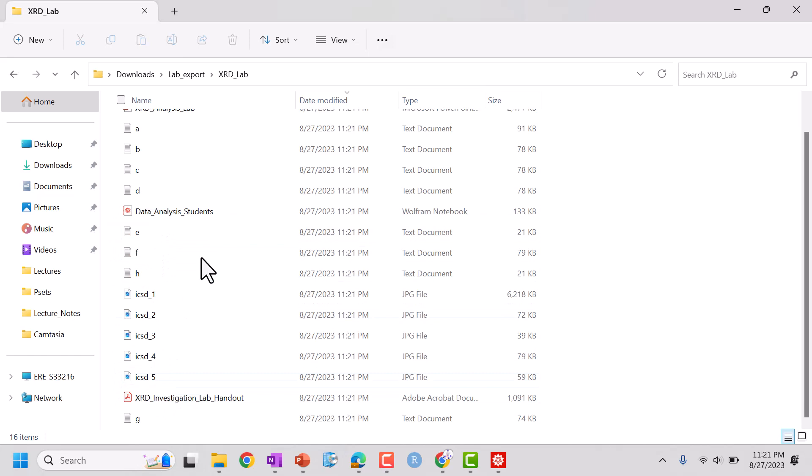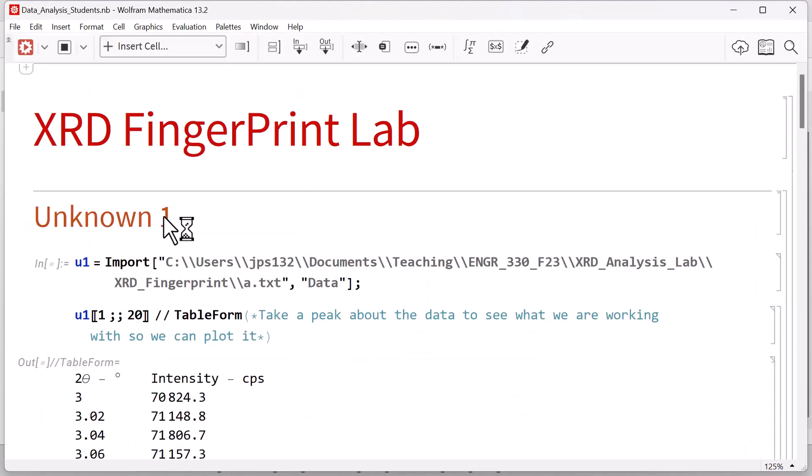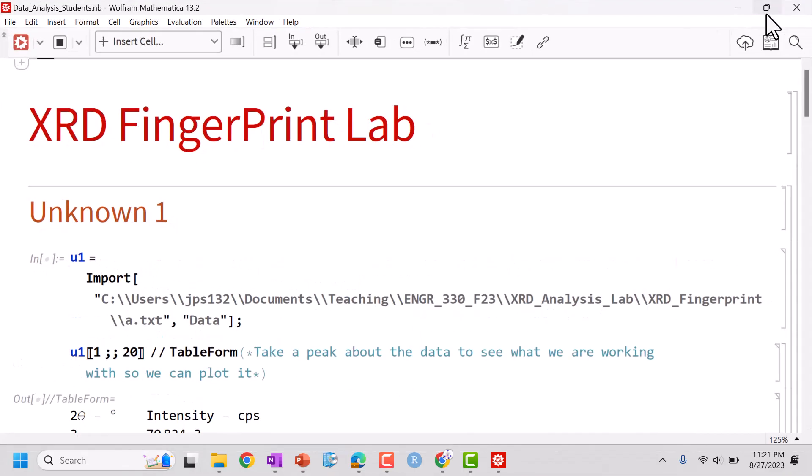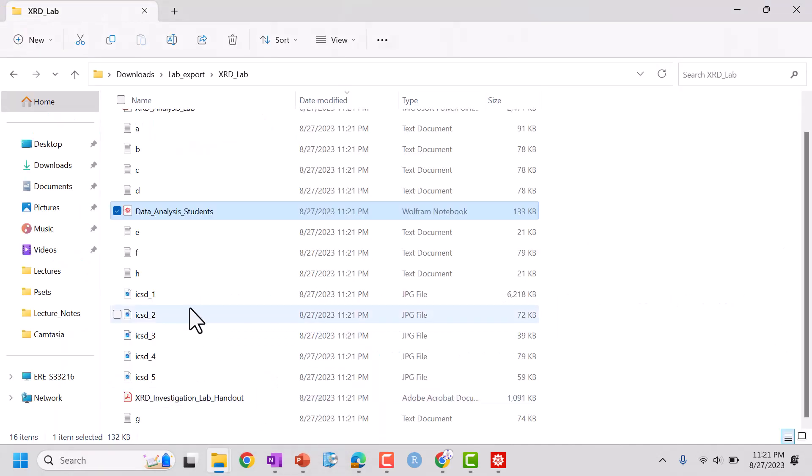We have pictures, data files, and we have our Mathematica notebook. So let's go ahead and open this. This is going to be the notebook that we use for our fingerprint lab. What we're going to do is read in raw data, plot it and visualize it, and then compare it to these five pictures.